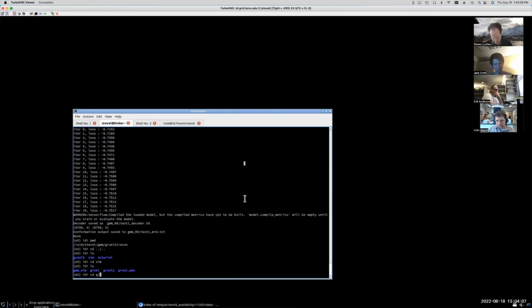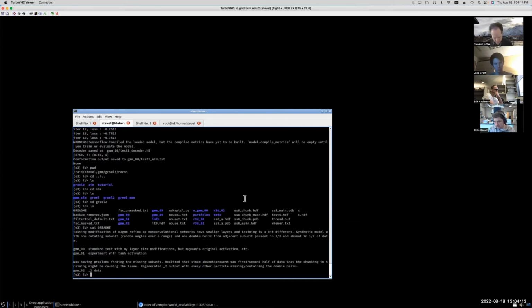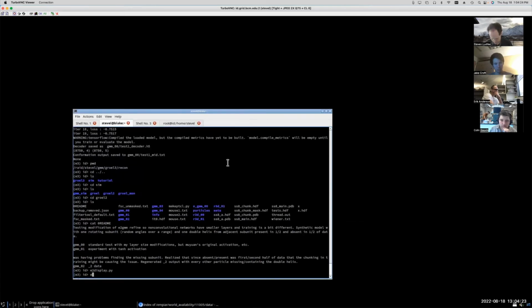I think probably leave this one. Oops, that's not what I meant to do.